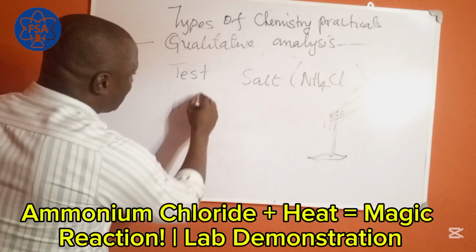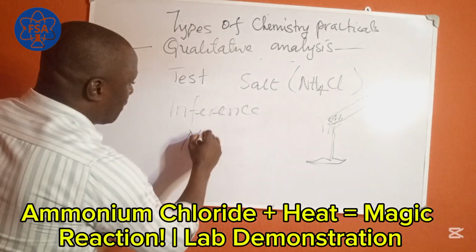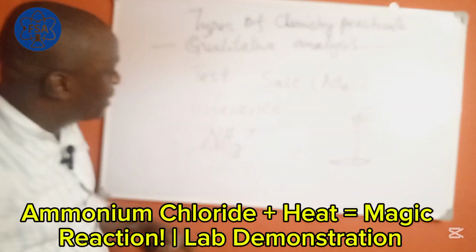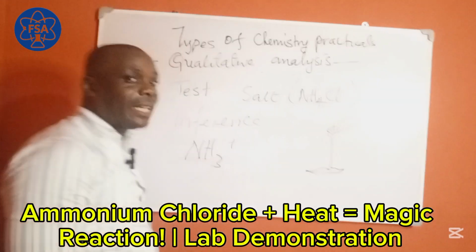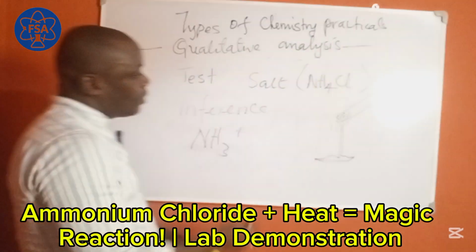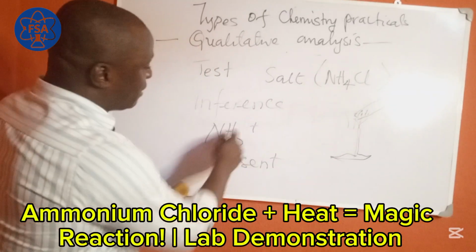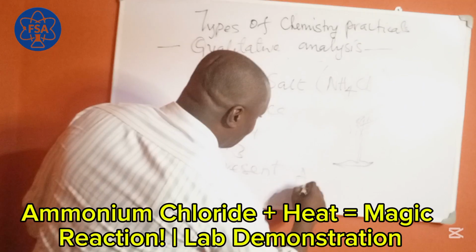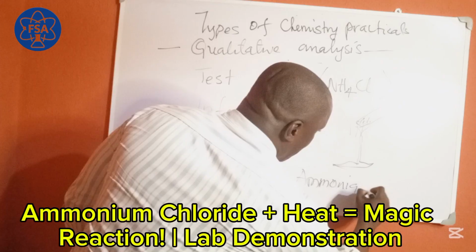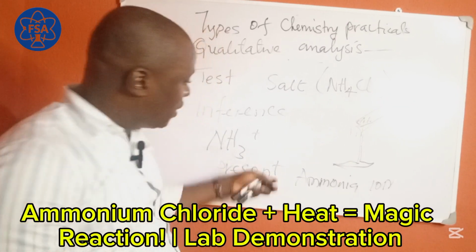So in your inference, you now see ammonia. This indicates that there is presence of ammonium ions.